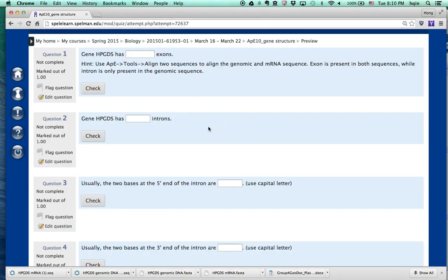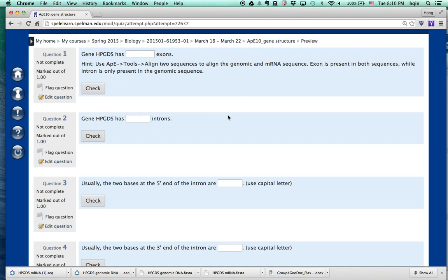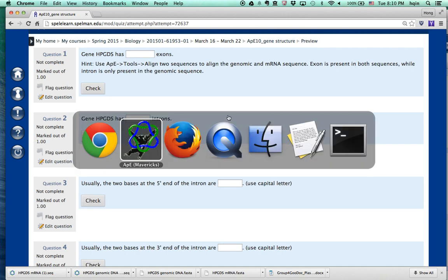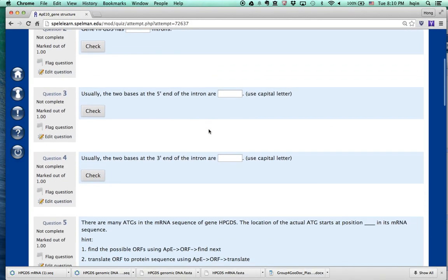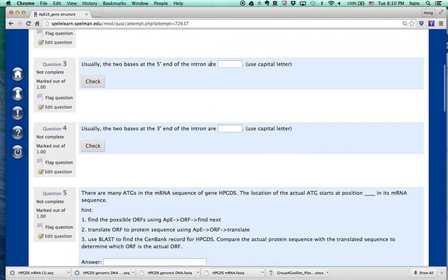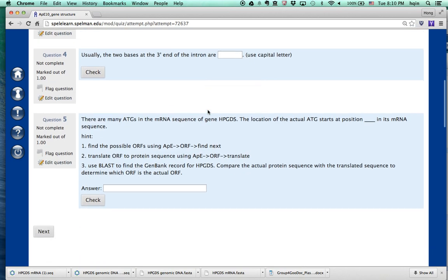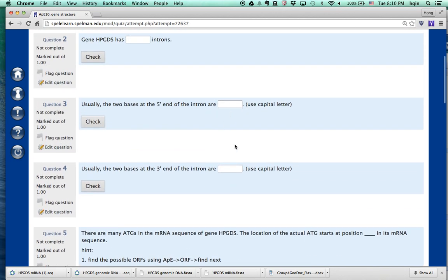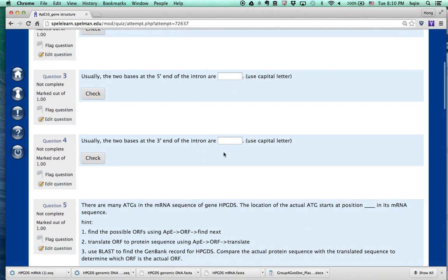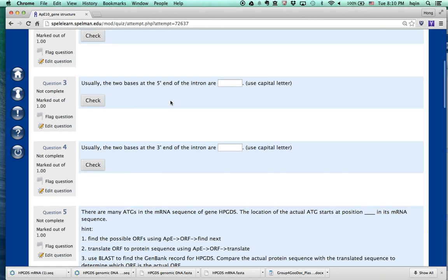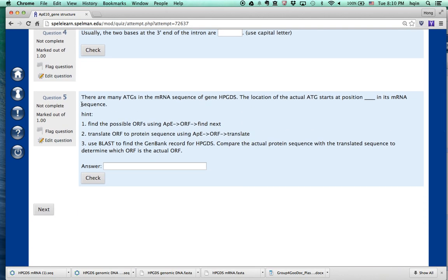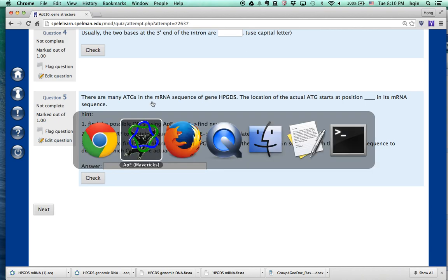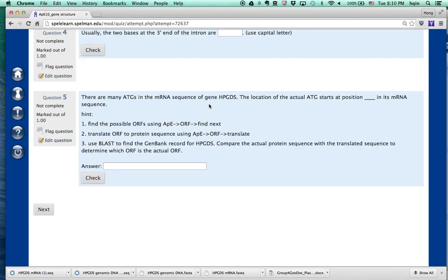So then, how many introns, how many exons we can find out. We're basically counting them. Then we answer the next few questions. The next few questions, you basically have to do some reading on your own. And then Google to find out what's the conserved nucleotide at 5' end and 3' end of introns in the eukaryotic cells. And then this is the last question, the interesting question. In the mRNA sequences, we see many ATGs, but which one is the actual ATG? The gene we actually used for the first methionine.